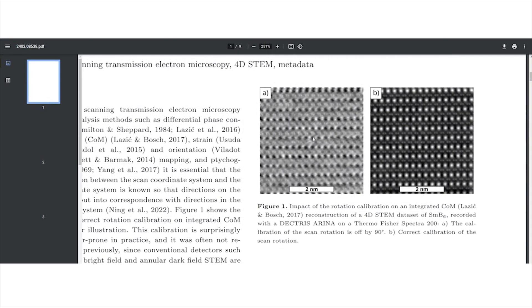Here's an example for integrated center of mass (ICOM). On the right we see a good reconstruction with correct values — a lanthanum hexaboride sample where you can very nicely see contrast from the boron atom columns as fine white spots, nicely resolved. On the left it's rotated by 90 degrees, so the spatial frequencies point in the wrong direction and you get a completely different result. If you miscalibrate this, you get literally garbage results. So it's really, really important to do this reliably.